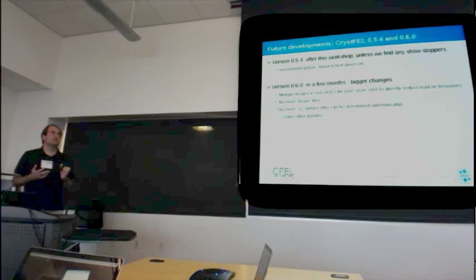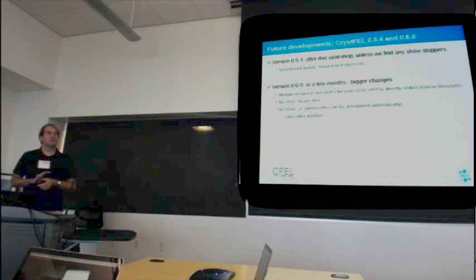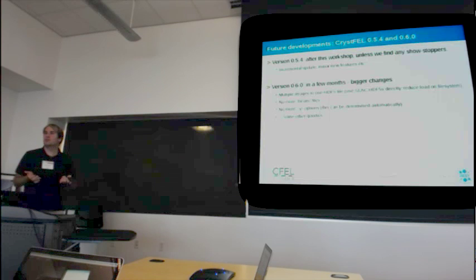It will enable us to use Cheetah's HDF5 files, which are files that the Cheetah system can produce for users directly. So whether you don't want to use it at all, or you want to use Cheetah's hit-finding, you can do that. The new version will support that. That's all ready to go as well. We just need to put it through testing.